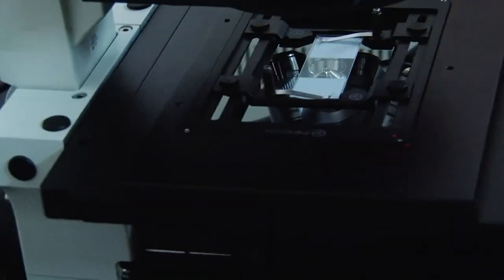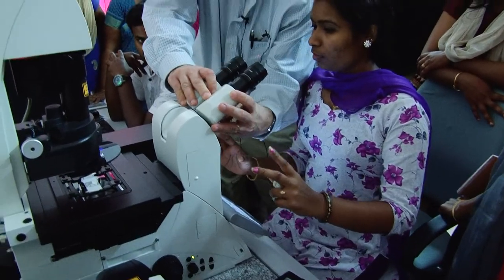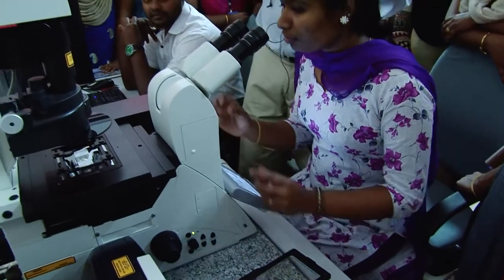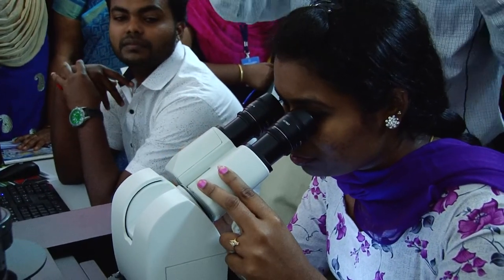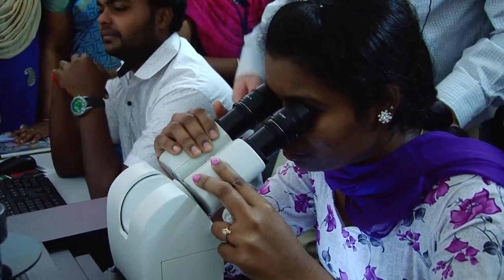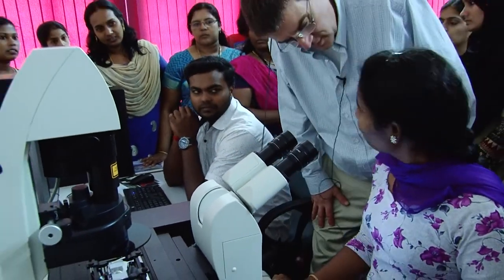Now, if you're gonna do this for hours, like I do all the time, these things actually usually adjust up and down. This one doesn't, but they do go closer, okay? And I do mine for hours and hours. I mean, sometimes I'm in there 6-7 hours a day. But you want to be comfortable, okay? So adjust your chair, all that, because you don't want to walk out and be stiff as a board.